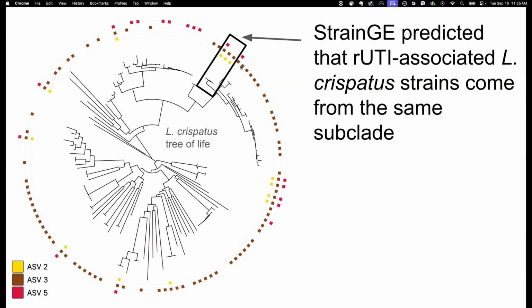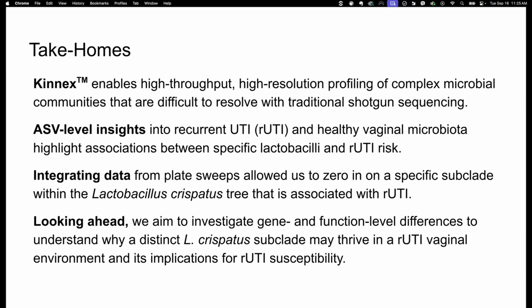All right, so let me just quickly take us through the take-homes that I'm leaving you with today, including how fantastic the Kinnex system is. I mean, it's high throughput, high resolution, and it's really just a wonderful workhorse, particularly when you're dealing with communities that are chock full of host. Based on these data, we've been able to glean some really interesting ASV-level insights that we think are pointing in a direction between the association between certain lactobacilli and rUTI risk.